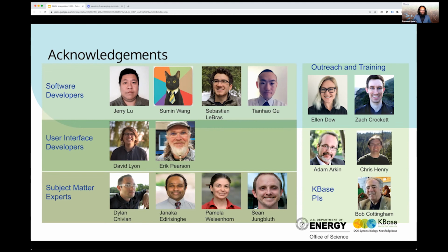Our concept is that if we have a lot of data using different methods, users will be able to sort that out and figure out which methods are working best. For some communities, that may be one particular set of protocols, but for another community with their environment, they may have some other set. So we're not prescriptive about protocols or how the data is generated. We just are trying to capture all of it and make sure users are aware of how the data was generated.